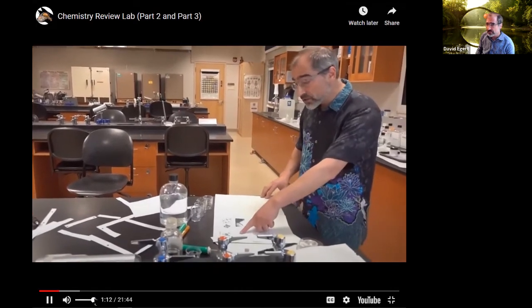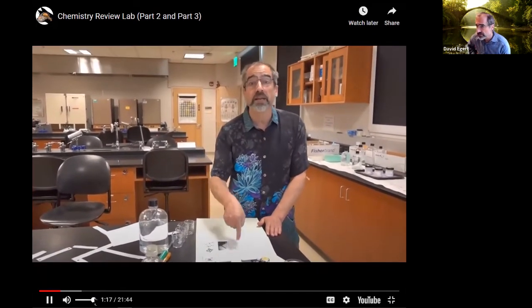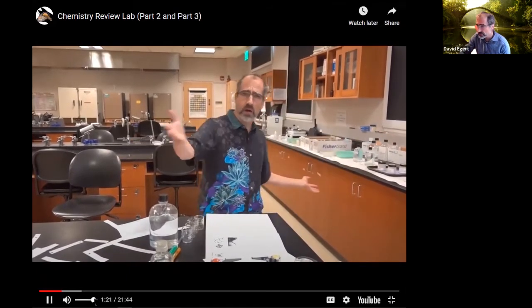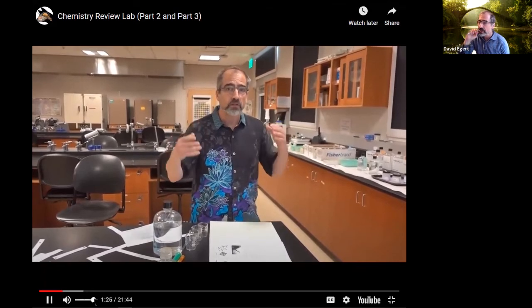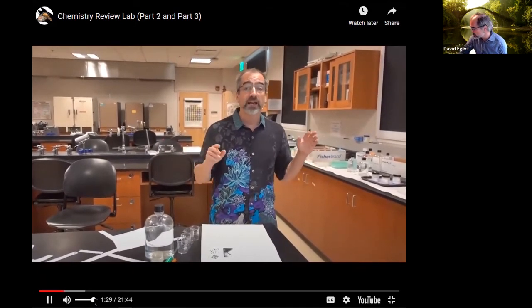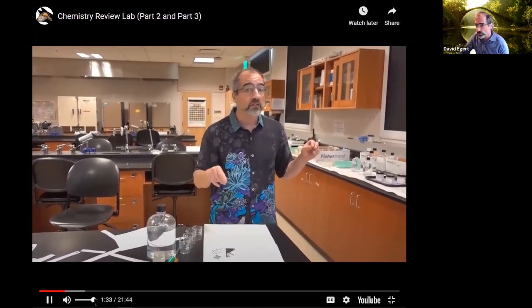And then I'm just going to follow. It's really important when you're doing the labs to follow it step by step. We'll be reviewing the broad overview of how the lab goes, but even if you think you know what you're doing, you still have to slow down and read step by step, because there are often subtleties.